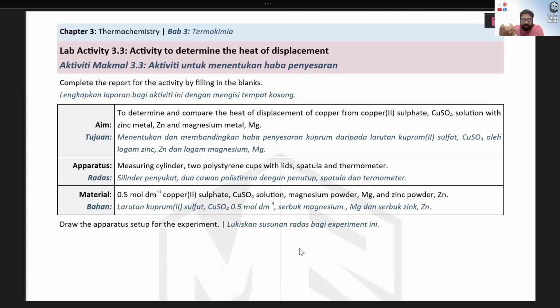All right, guys, it's finally time to do your Amali exam. So in this video, we're going to discuss this experiment, heat of displacement. Heat of displacement in the textbook is actually an activity, right? It's not an experiment. So that's why in the textbook, you won't see any variables. But today I'm going to make this into an experiment.